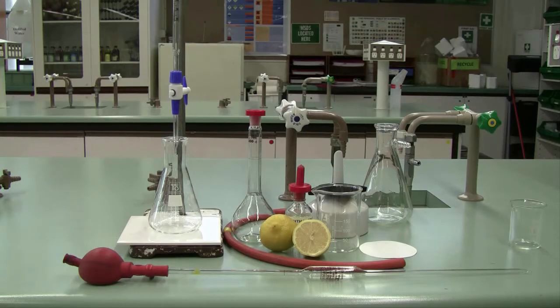Today we're going to be investigating the concentration of citric acid found in lemon juice, and we're going to be doing that by acid-base titration. Learning the technique of titration will expose us to a variety of very important analytical skills — essential skills required for chemists.